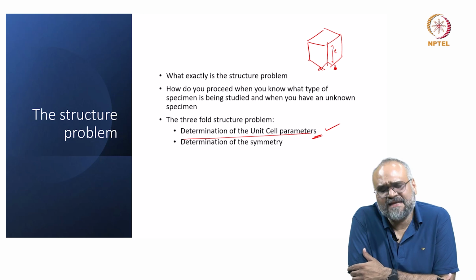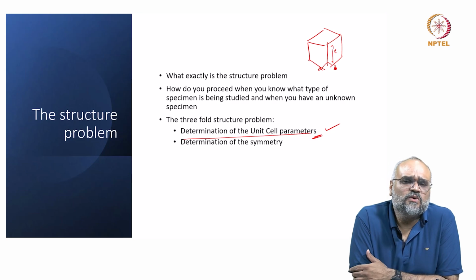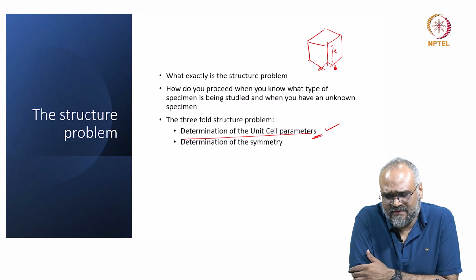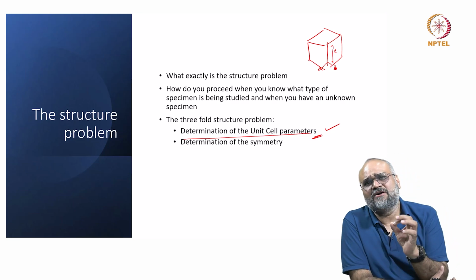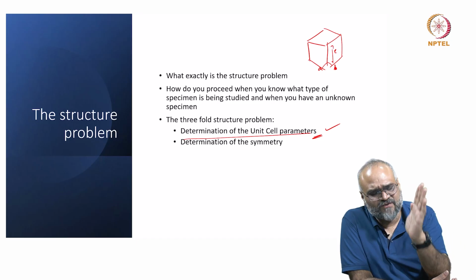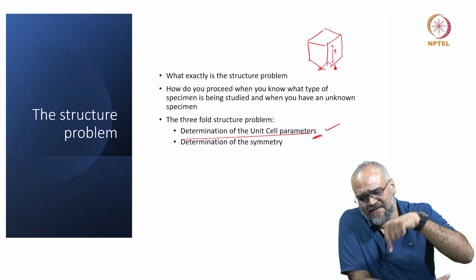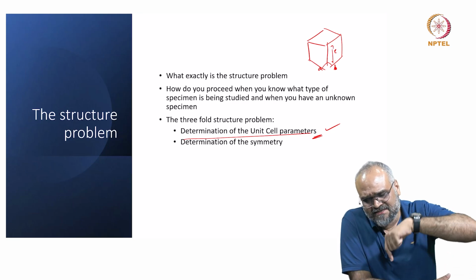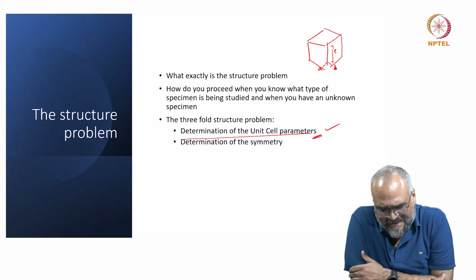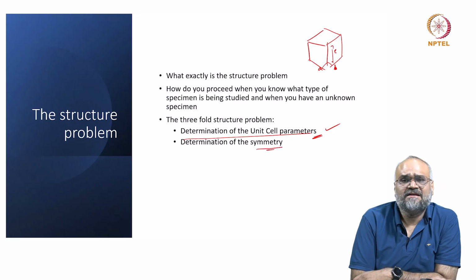But if you notice the electron diffraction patterns, because I am looking at the two-dimensional distribution of intensity, what I have is inherently some signature about the symmetry, because I am looking at the projection of the information from a crystallographic plane at the back focal plane. I inherently get information on how the two-dimensional distribution of these atomic planes is, which is reflected in the diffraction pattern as well. There are ways in which you can get this information on symmetry strongly.